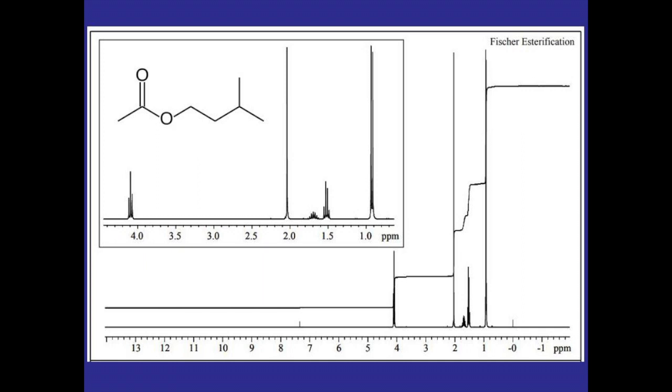And to be consistent, let's have everyone label the hydrogens with letters. To do this, I generally start on one side of the molecule, usually the side with the highest priority functional group, and then move across the molecule labeling all of the hydrogens. So in this case, I'm going to start with the methyl group on the side of the ester. These 3 hydrogens are all equivalent, so we can go ahead and label all of them with the letter A. And when doing this, you don't have to draw out every single hydrogen and label them all individually. Since these 3 are equivalent, you can simply label the carbon that they are attached to with the desired letter.